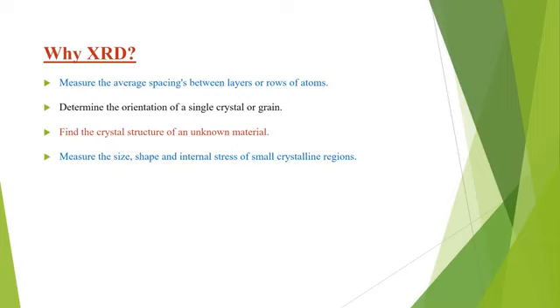It can measure the size, shape, and internal stress of small crystalline regions. So these are the main aspects of XRD.